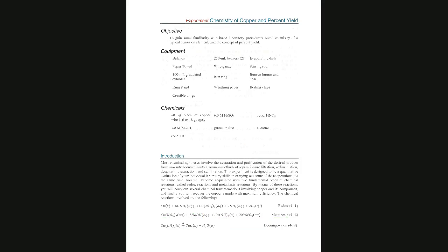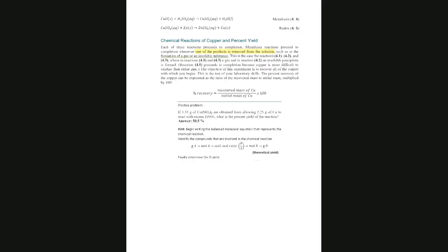Okay, so let's look at the other two reactions. What happens in the fourth reaction? They are telling us that it's a metathesis reaction. Can we see that? Yes, we can. Awesome. Yes, exactly. Emily, the answer is that for that part, but then they're going to ask you again, what are we washing in another? In that, when they ask you about that specific reaction, yes, we are removing the sodium nitrate. That's correct.